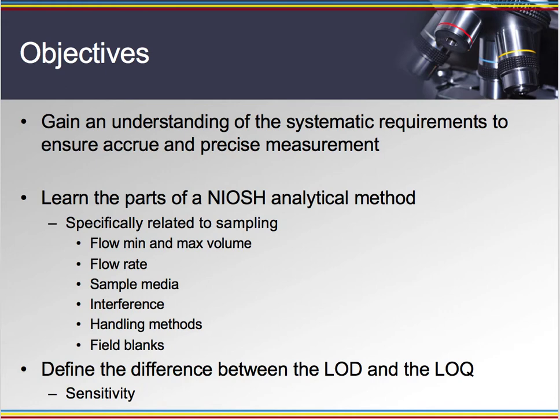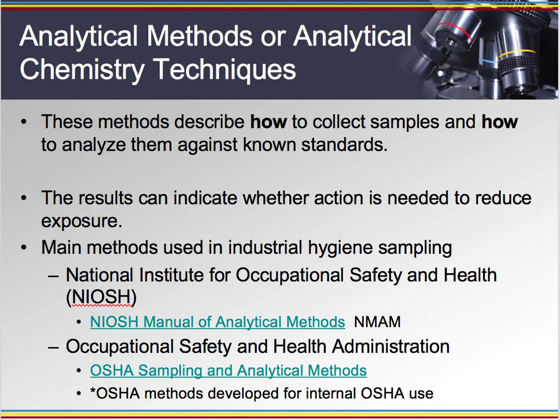One thing that may help you is if you go to the NIOSH website or to our Moodle site and download an analytical method, one of those examples that I put up there, for example, for silica or formaldehyde, so you can look at it as we're going through the material. And finally, we'll start to get into the analytical sensitivity and the difference between the lab's ability to detect and quantify material or concentrations of agents which you send to them.